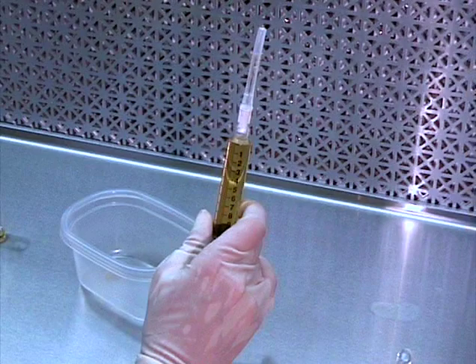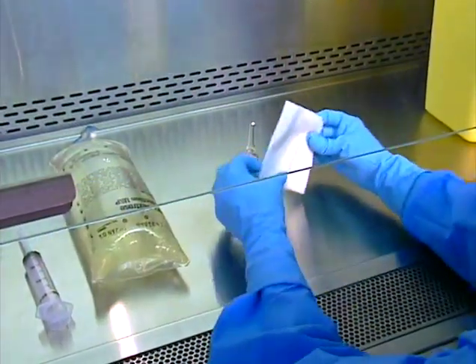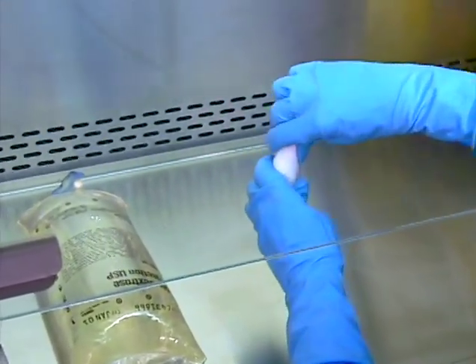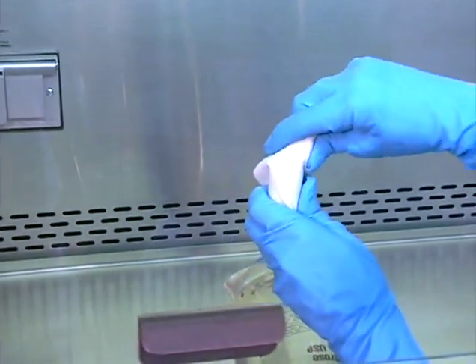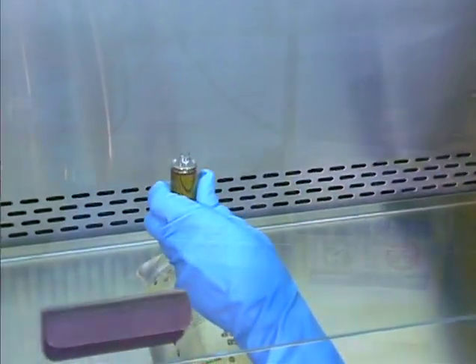When working with hazardous materials and ampules, be sure that all drug is removed from the top and wrap the entire upper portion of the ampule with a sterile gauze pad to contain any splattering drug or glass. Alcohol pads are not recommended for this purpose because the alcohol may cross-contaminate the drug.